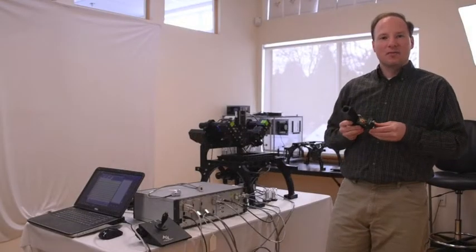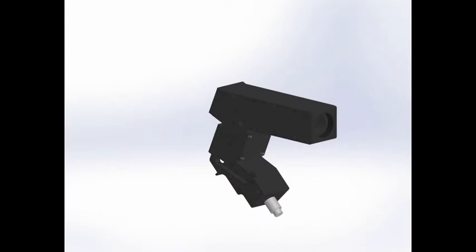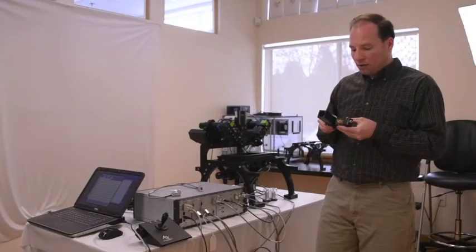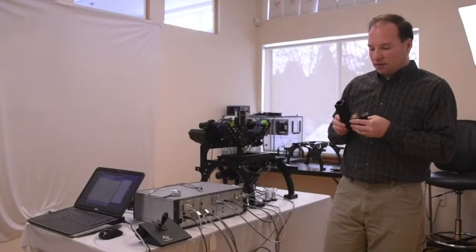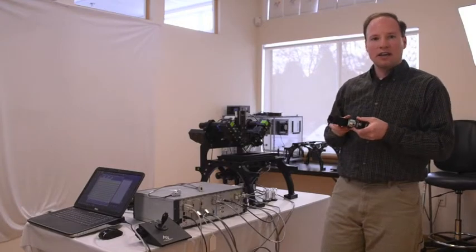Now I'm going to tell you a little bit about the scanner since it's a new component of our system. The scanner takes a fiber input of light and turns it into a light sheet. So it contains a fast 2D galvo, and we scan one of those axes very fast to form the light sheet, and then the other is used to scan the sheet through the sample. The galvo is fast enough for imaging at 200 frames per second.